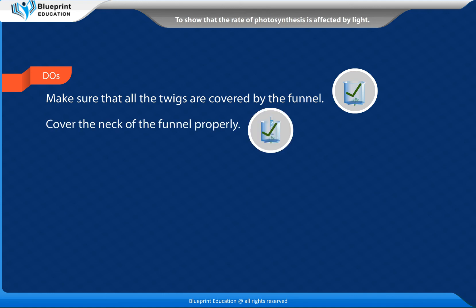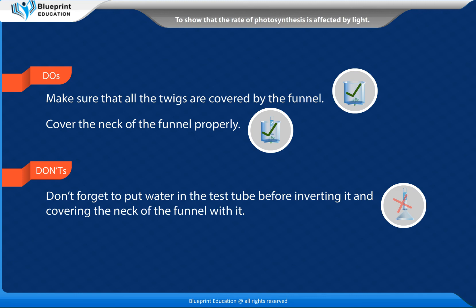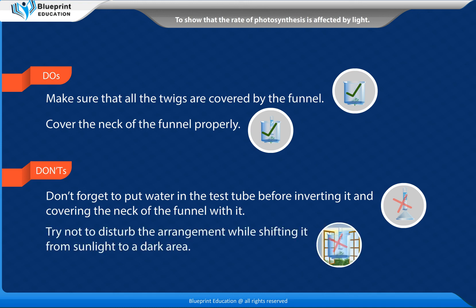Cover the neck of the funnel properly. Don'ts: Don't forget to put water in the test tube before inverting it and covering the neck of the funnel with it. Try not to disturb the arrangement while shifting it from sunlight to a dark area.